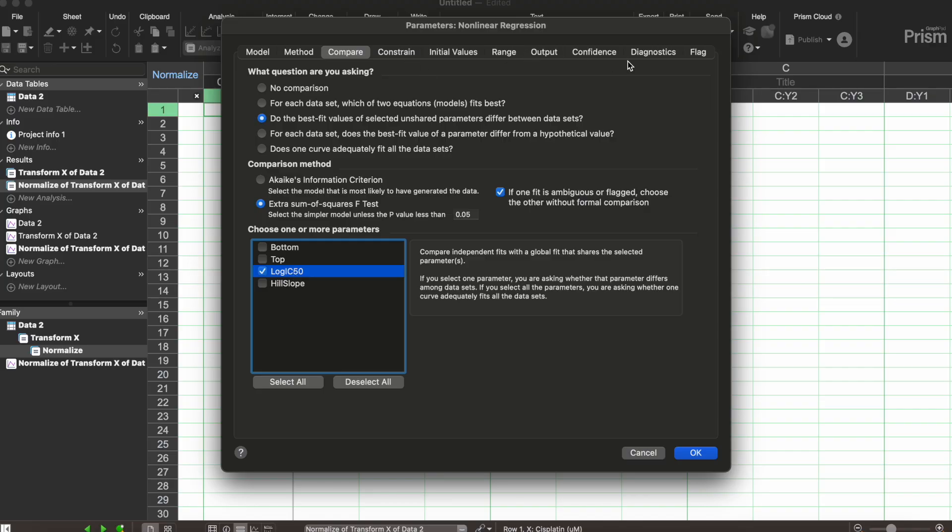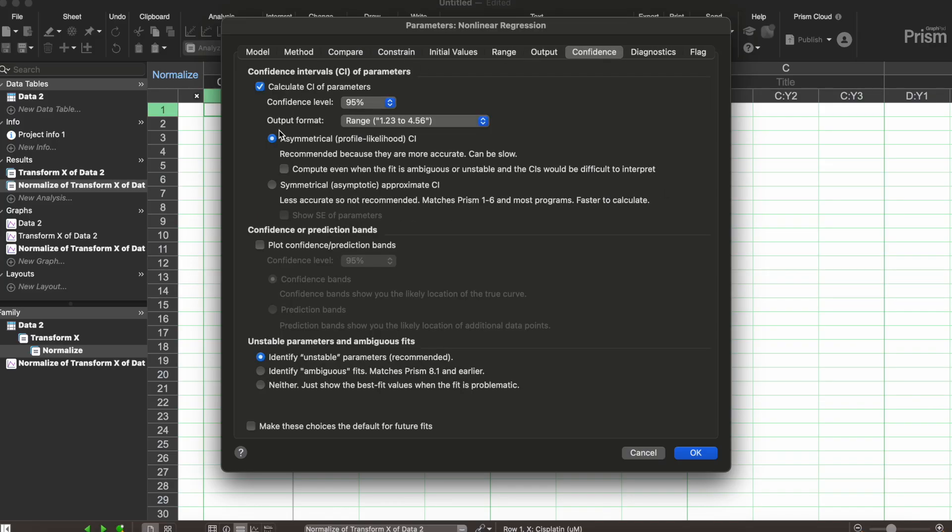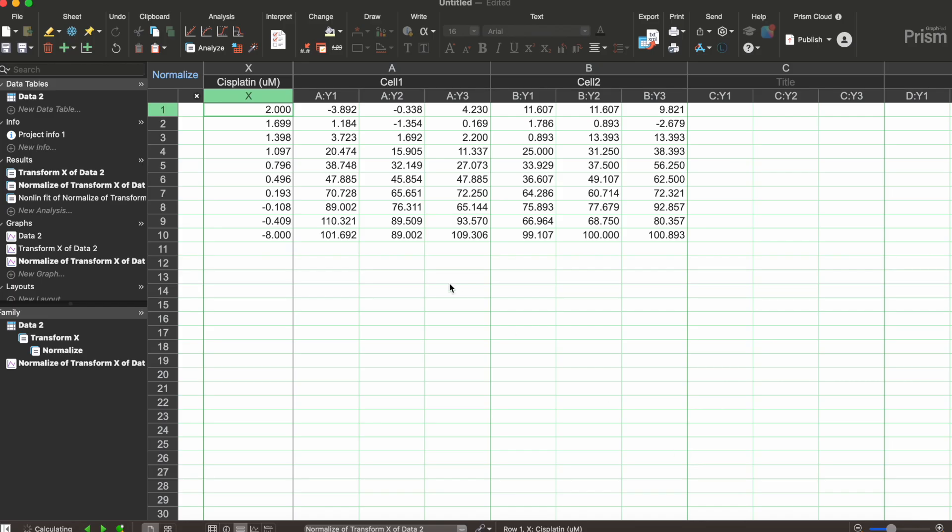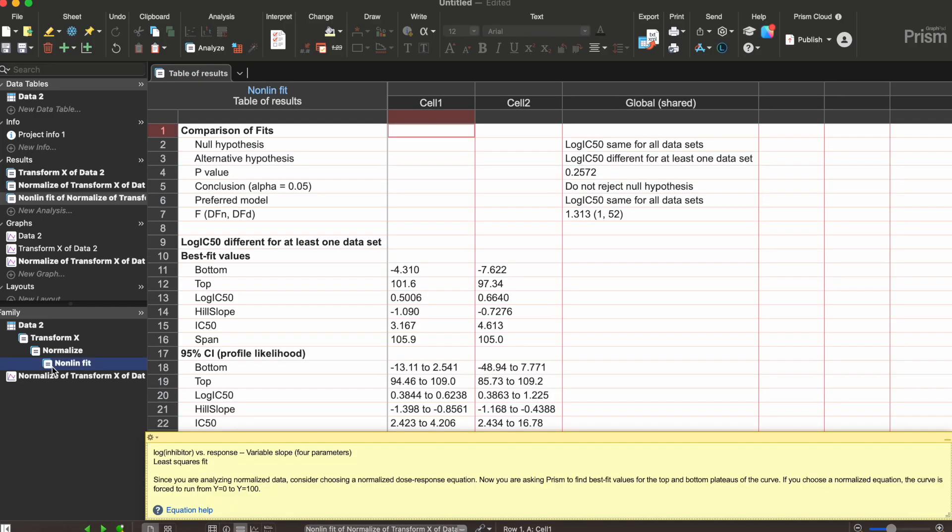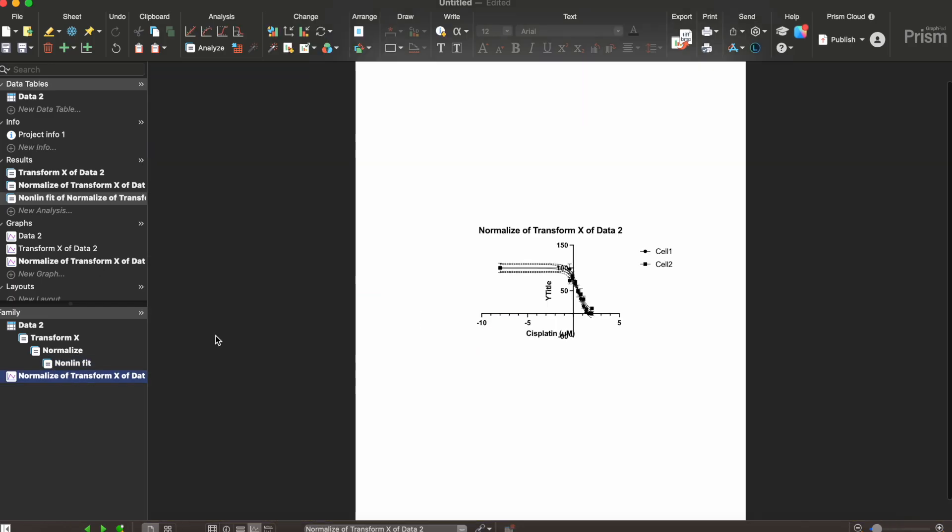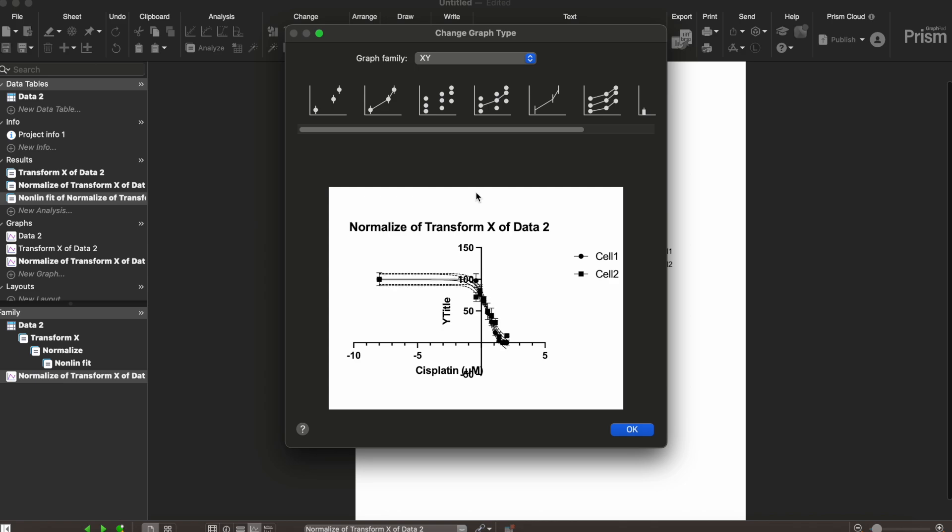Then we're gonna go to confidence. We want to plot confidence prediction bands at 95%. We're gonna go ahead and just push ok now because we're done with this and it went ahead and it plotted something very nice here. It doesn't look nice but it will be.